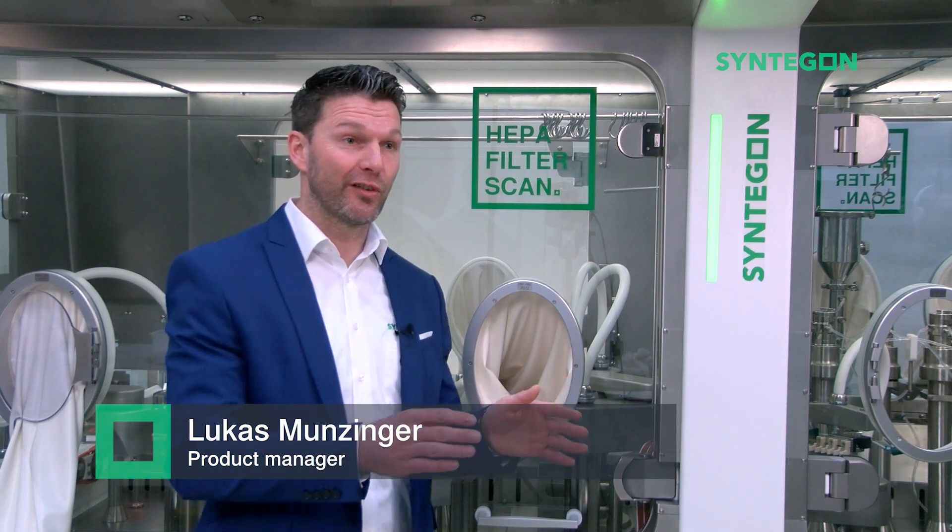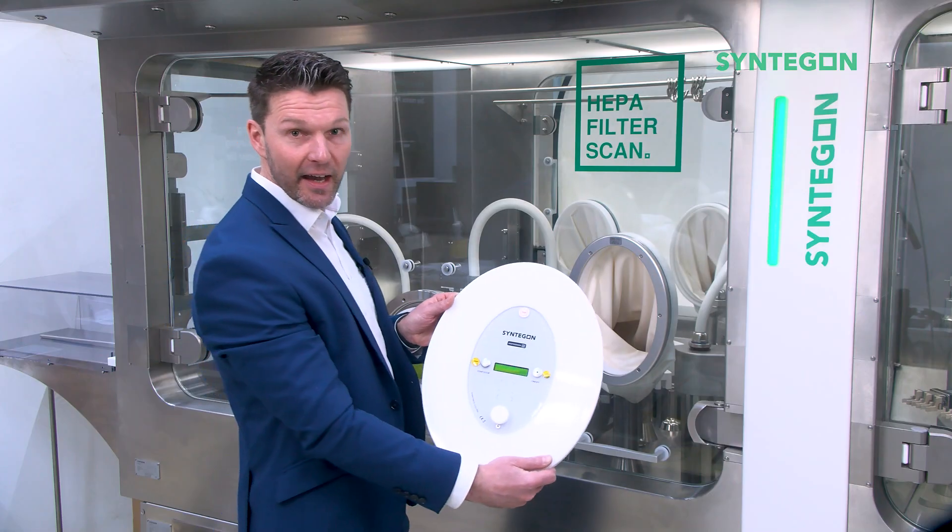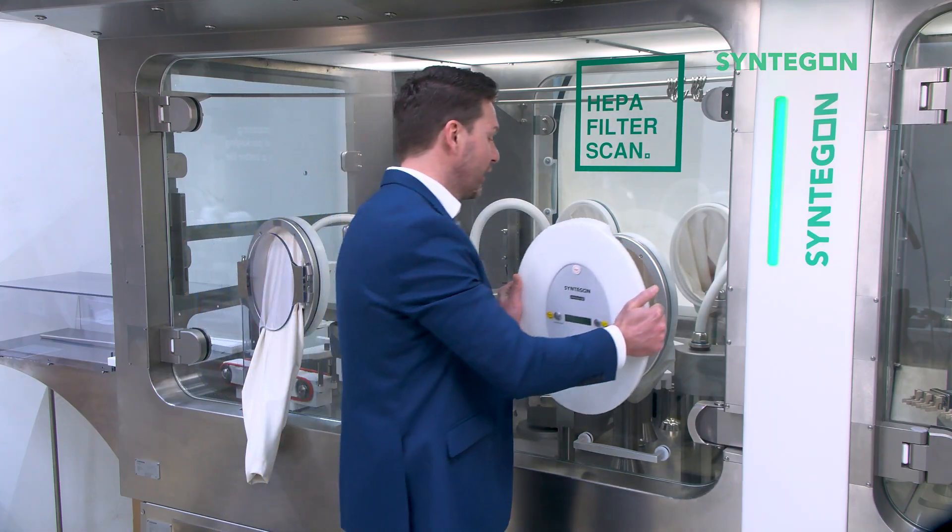No matter which of the different systems you choose, the function of actual glove test performance is fully automatic and easy to do. Insert the test lid into the glove port.